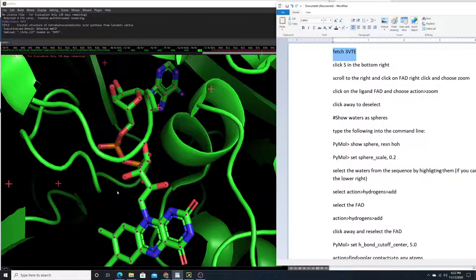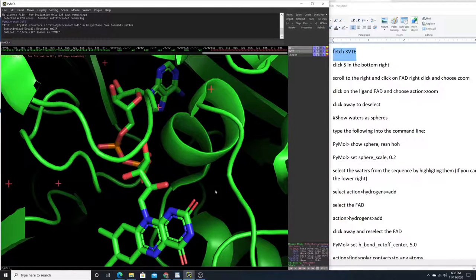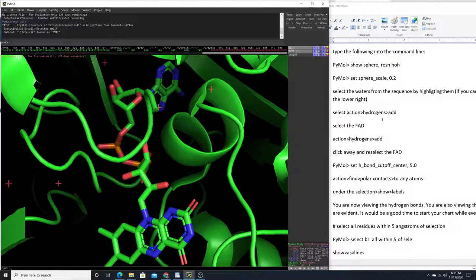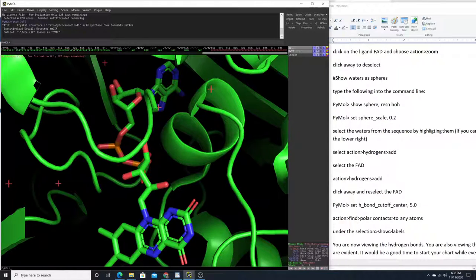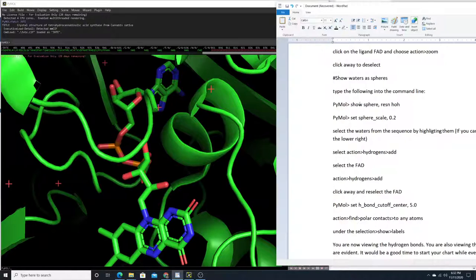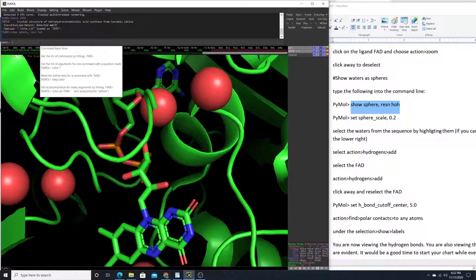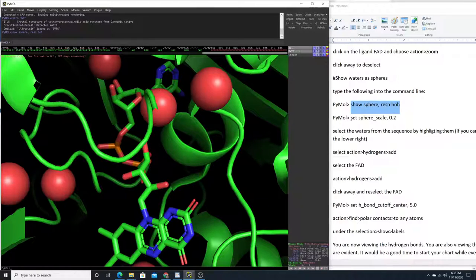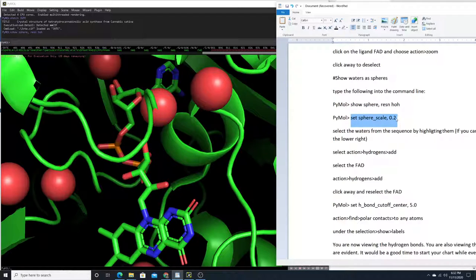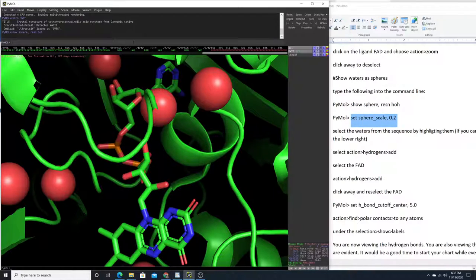I'm going to use the default settings for coloration and display at this point, except for the waters — I'll change those a little bit. Click away to deselect the ligand, and we want to show our waters as spheres. Type into the command line: 'show spheres' for the waters. Those are a little large, so let's scale them down to make them smaller.